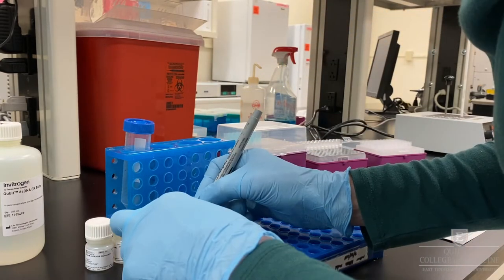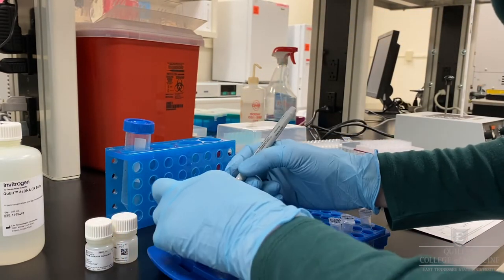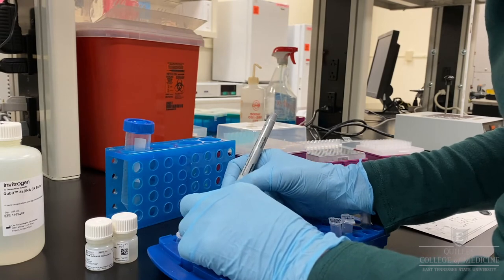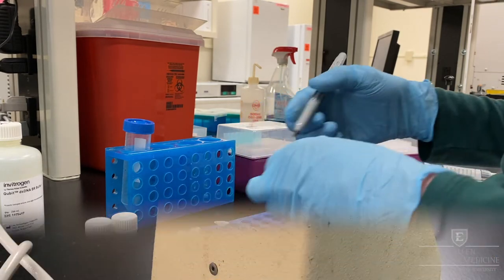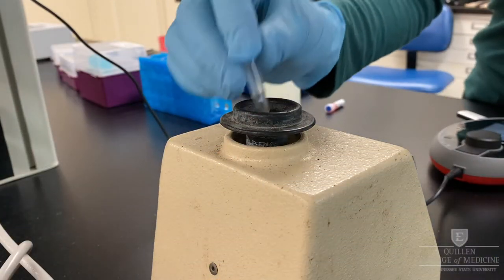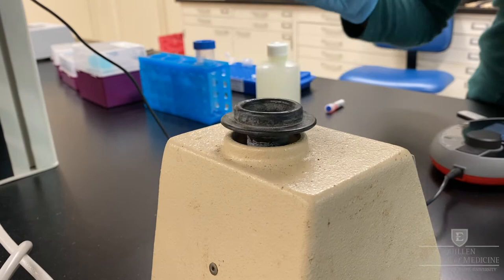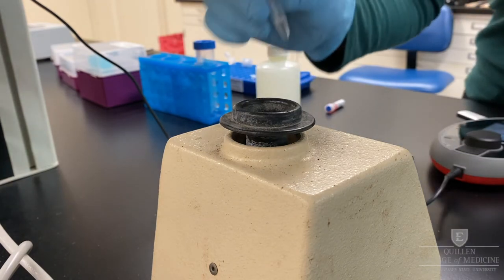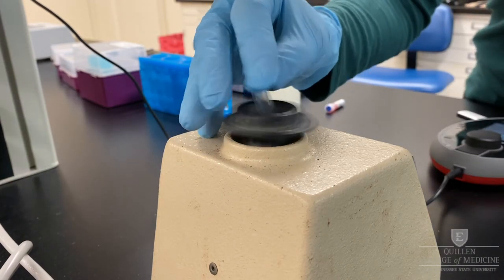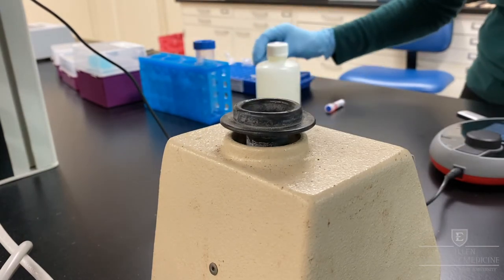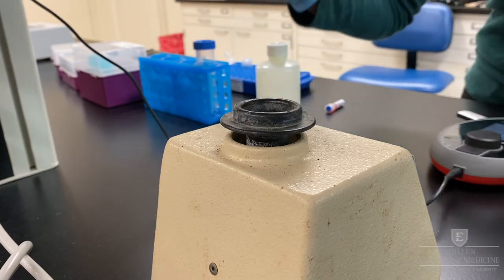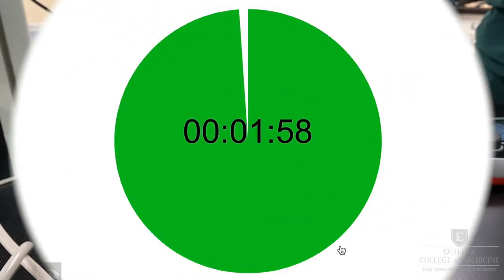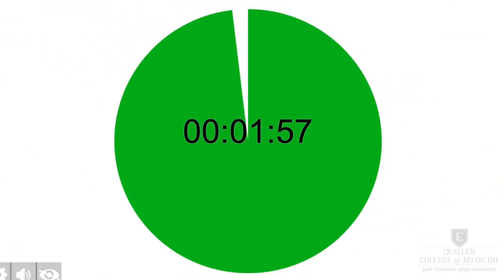Make sure you label each tube. This is particularly important if you are measuring multiple samples. Vortex each sample to combine well, then incubate for 2 minutes.